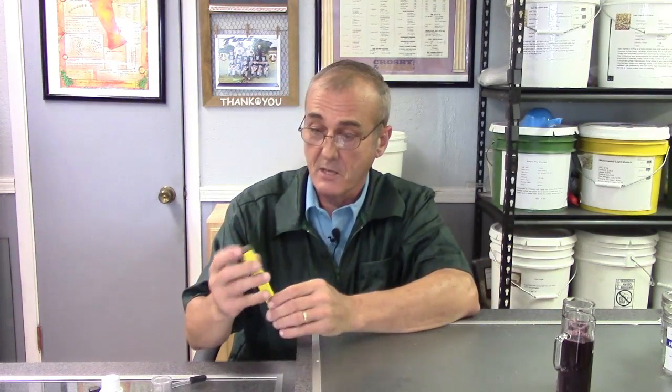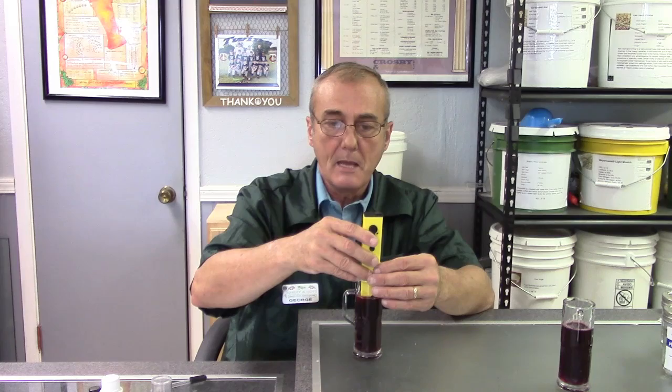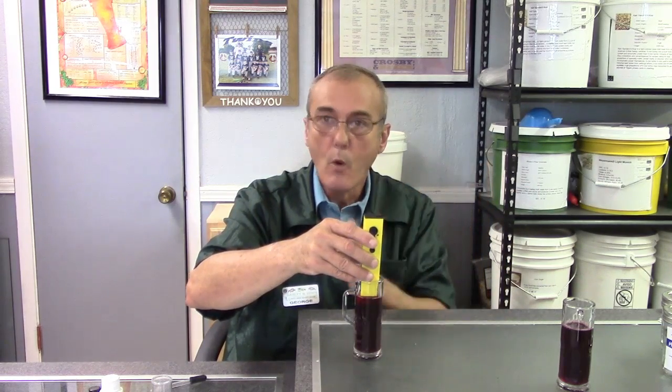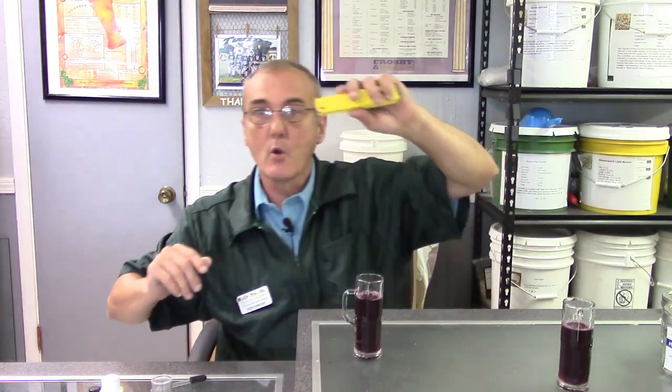The pH meter is simple — just take the cover off, turn it on, and you get a digital readout. Our goal is to have a pH of anywhere from 3.2 to 3.65. The pH scale goes from 1 to 14, with 7 being absolutely neutral. I'm sticking the meter in now and reading... I'm at 3.5, then 3.4 — well within the range, right in the middle. I'm happy with that.